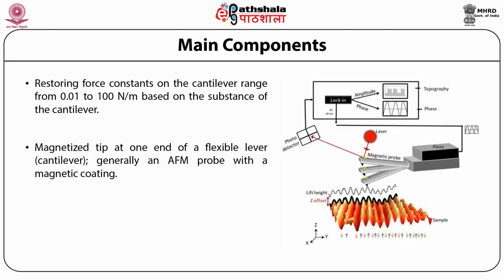So we have the diagram given here. Then we come to the overview of this. In magnetic force microscopy, when we start measuring, it involves the magnetic force between the sample and the tip, and it can be expressed by a mathematical relation which has been given below. Here, M is the magnetic moment of the tip, approximated as a point dipole. H is the magnetic stray field from the sample surface, and mu0 is the magnetic permeability of free space.